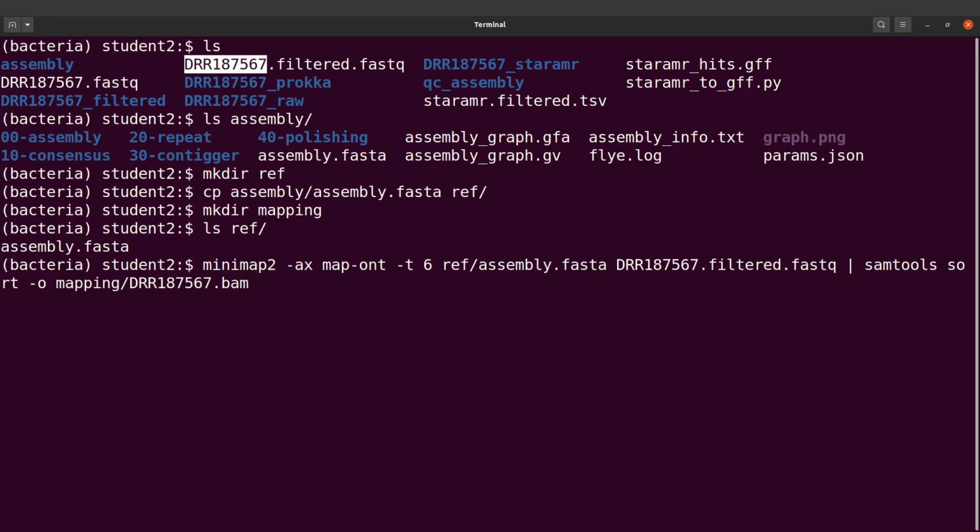All right, you can also use .sorted.bam. That's also fine. So it depends on what you want at the end, but I'm using .bam because I'm going to generate just a single BAM file. But anyway, let's use .sorted.bam. I think that's better so that we have a description of the file. So we will say this .sorted.bam.